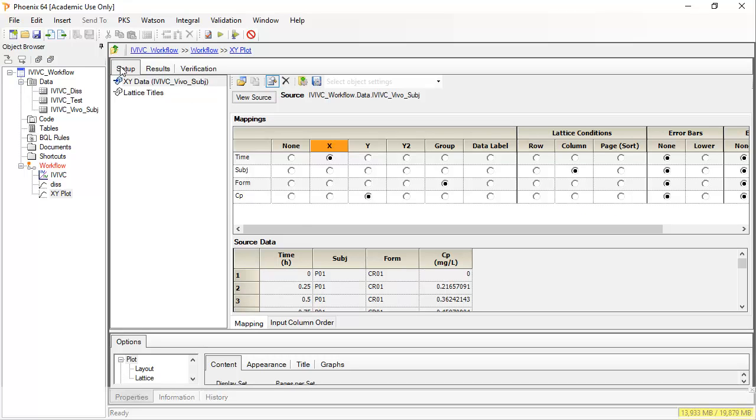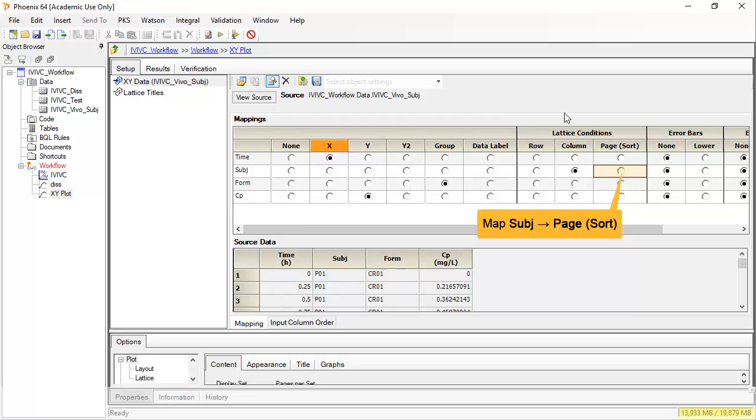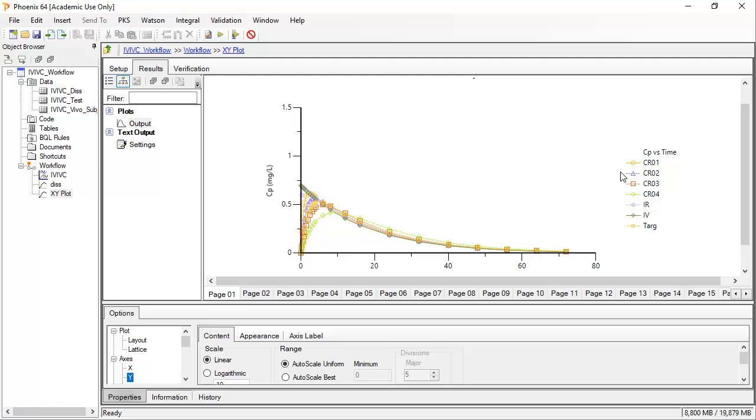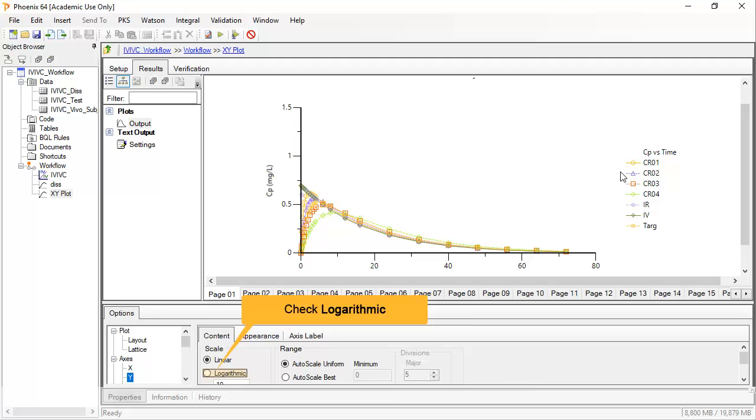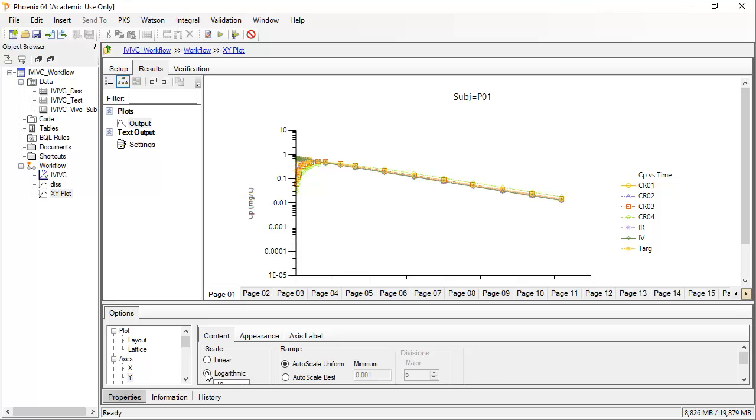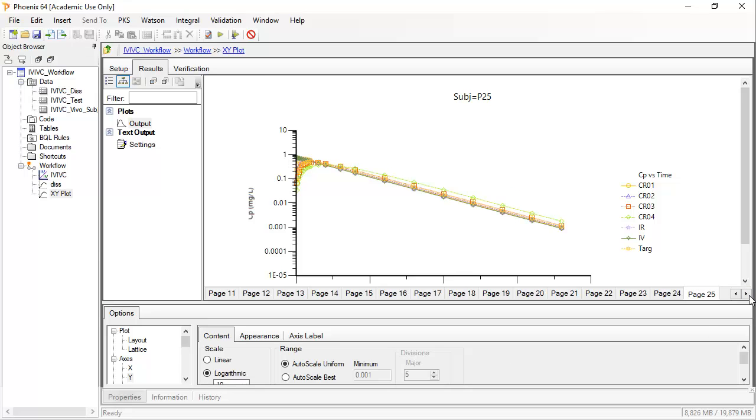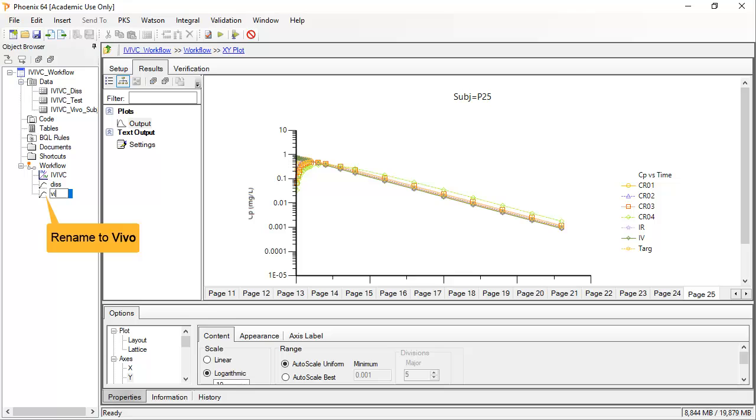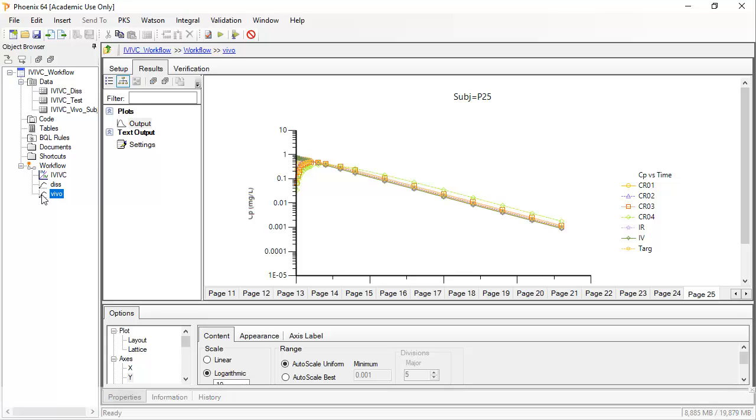At any time you can return to the setup, for instance to change form to group and place each subject on its own page. We can see each formulation displays the same elimination when displayed semi-log. I will rename the second XY plot as vivo. Now we have a better feel for the data, let us take a look at the IVIVC object itself.